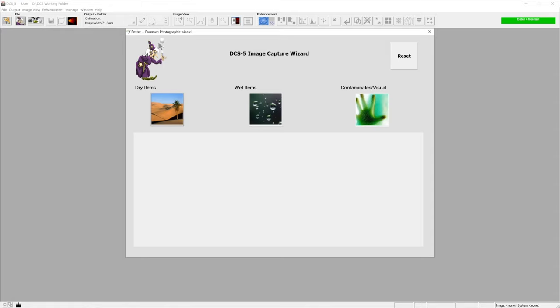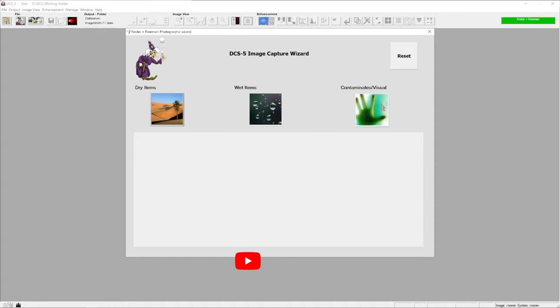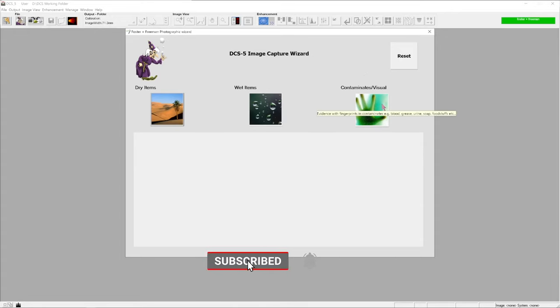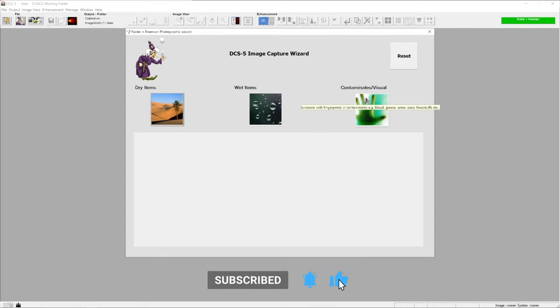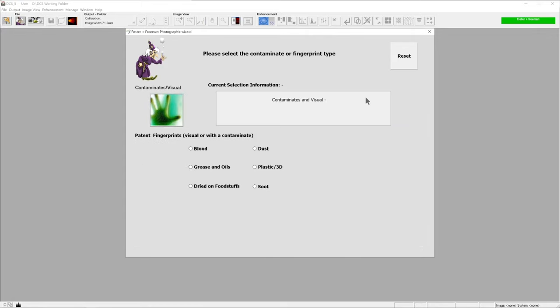All of our photography techniques are split into dry items, wet items, or contaminants. From here, we're just selecting what our piece of evidence is - whether we're looking at a dry item, an item that has been previously wetted, or a contaminant or visual mark. Potentially a pre-treatment mark or a mark that is in a contaminant on a surface, maybe something like blood or grease.